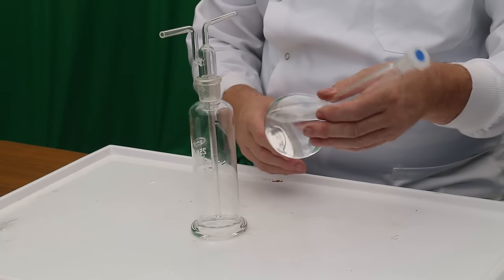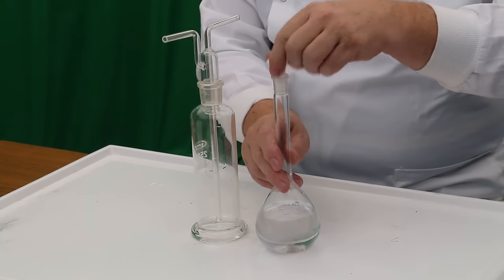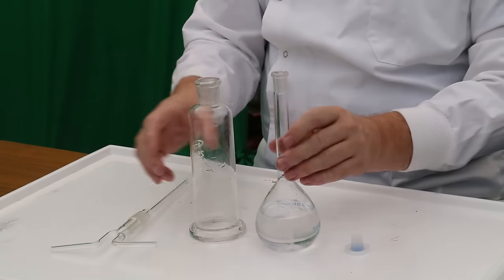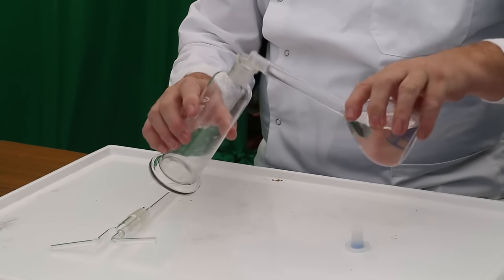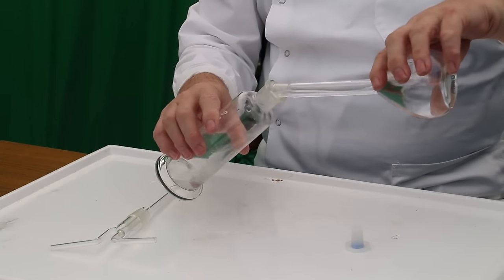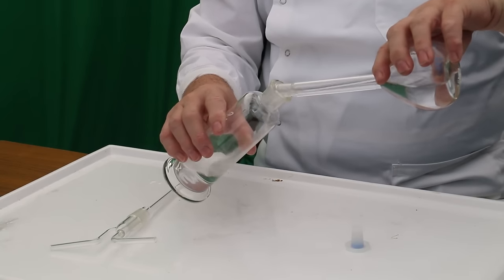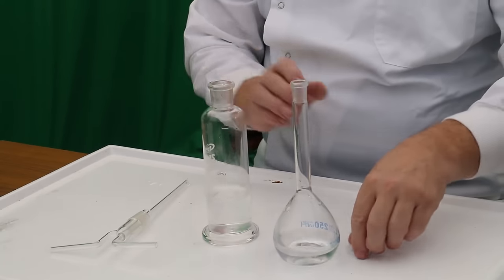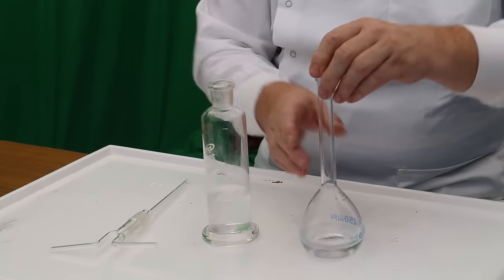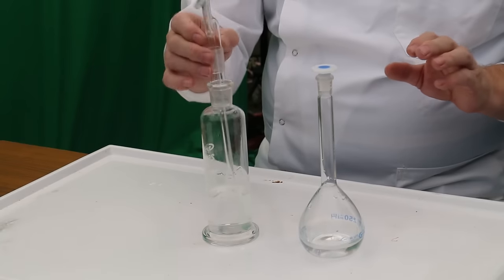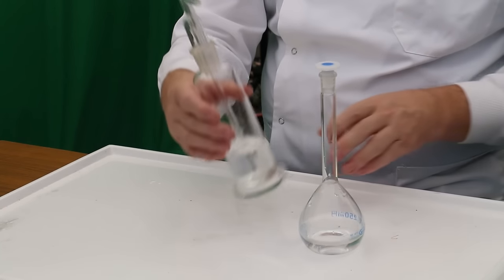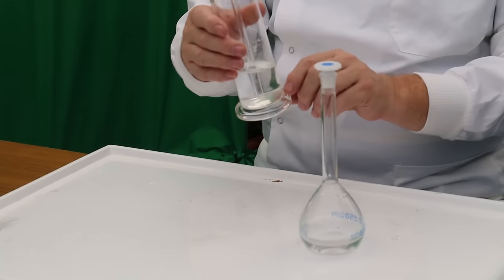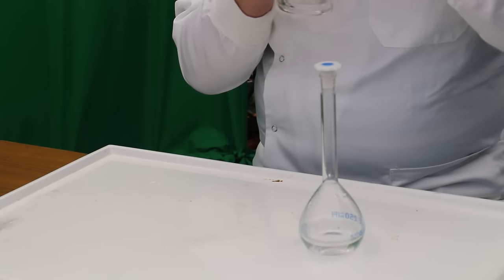Now that we've made our lime water and it's been filtered, what we're going to do is see if it works. We're going to test for carbon dioxide. What we're going to do is pour some of the lime water into this flask, and then I'm going to blow into here to see if this lime water will turn cloudy.